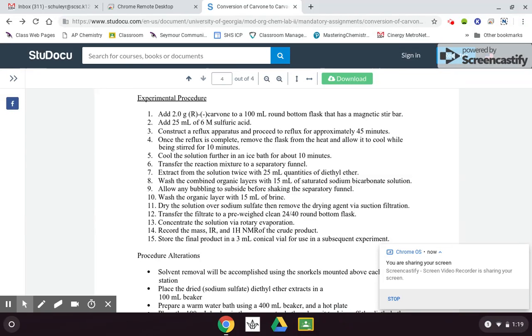Here's where we're going to make the difference. Your lab says use whatever our amounts are for petroleum ether, change it to diethyl ether. The ether will evaporate a lot easier than petroleum ether, and it won't smell like gasoline in there when you get rid of the solvent. Remember, be careful with the ether. You kind of get that narcotic effect.